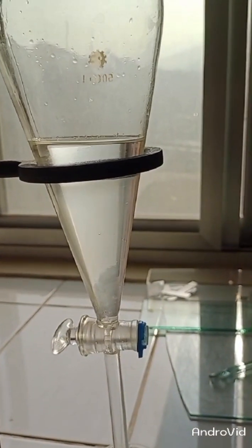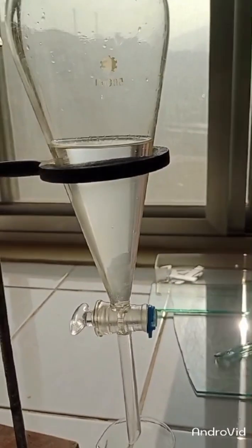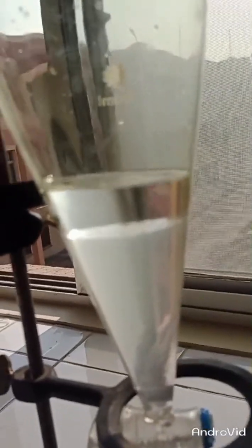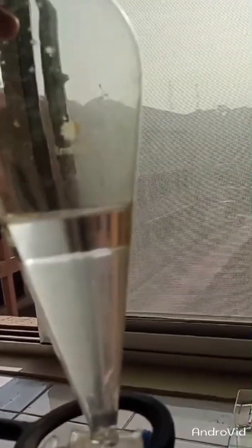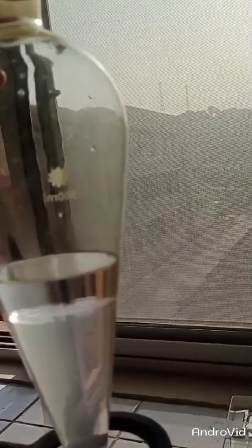Now we have to wait a while. You can see two layers forming: one will be the organic layer and the other will be the aqueous layer. You can clearly see one layer is of ethyl acetate and the other is the aqueous layer. The density of ethyl acetate is much lower than that of water, so it will rise to the top.